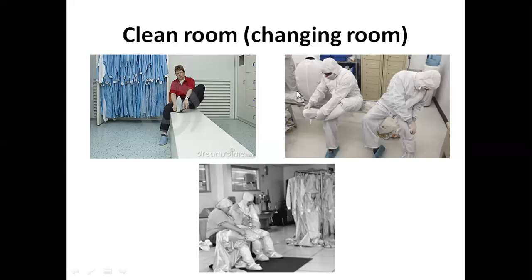As I told you, when you are entering, the changing would start from the top. First you have to put the head cover or hair net, mask, coverall, and then the shoe covers, gloves, etc. And then you have to enter the clean room.